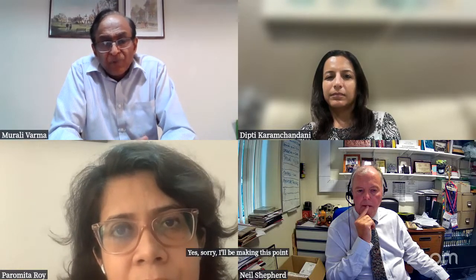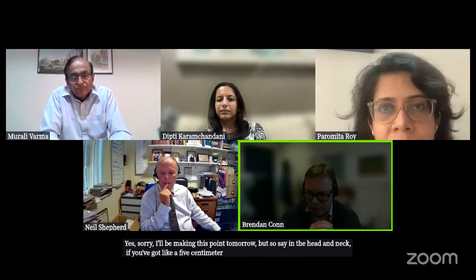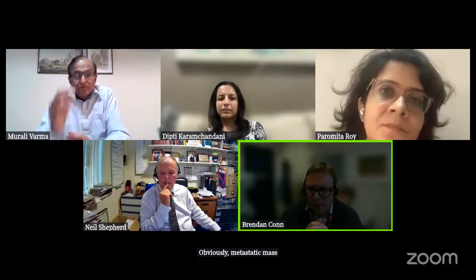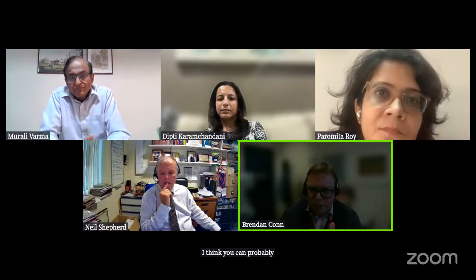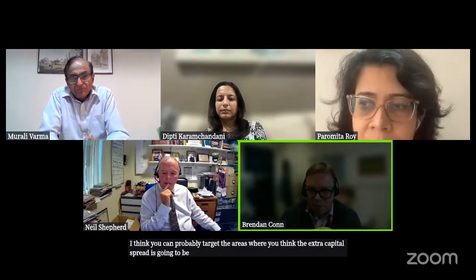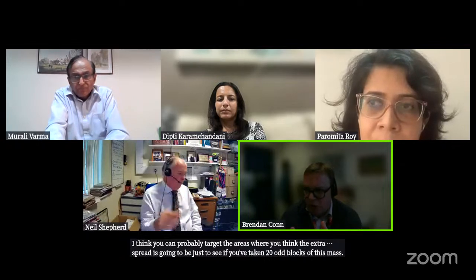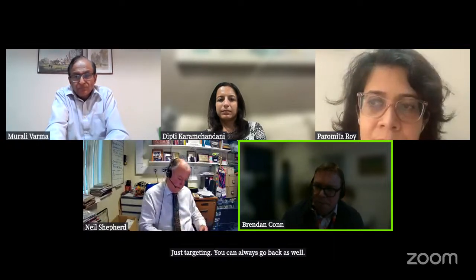Yes. Sorry, I'll be making this point tomorrow, but say in the head and neck, if you've got a 5 centimeter, obviously metastatic mass, I think you can probably target the areas where you think the extracapsular spread is going to be, just to save you taking 20 odd blocks of this mass. You can always go back as well.